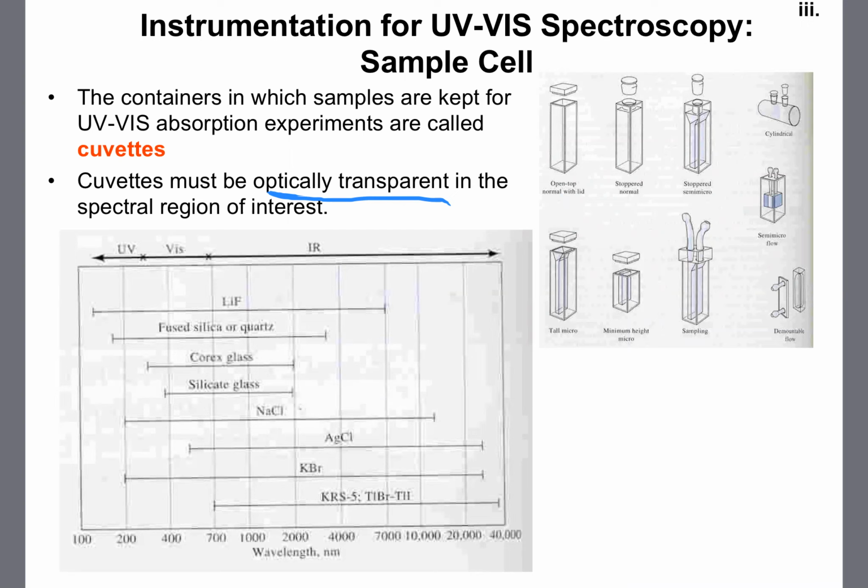However, for UV light, the situation is not so easy because we can't see UV light. So it's at least possible that you choose to pick a cuvette that is not UV transparent. And for the longest time, you have probably seen cuvettes that are square like this, made out of various different polymers or plastics, okay?